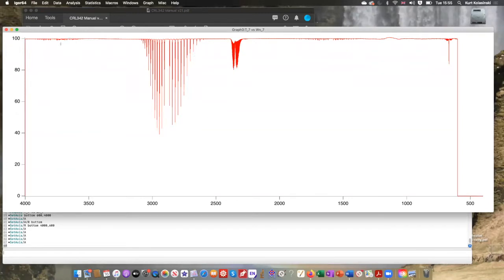maybe the couple that we had up here, and this HCl, which is another linear molecule, because of course the diatomic is always linear, it also has that structure of a branch, a missing bit, and another branch, a group of lines that sort of seem to act the same way. And up here, these are a mixture of CO2 and H2O lines, right? Some hydrocarbons might be able to absorb way up here as well, but that's pretty high.